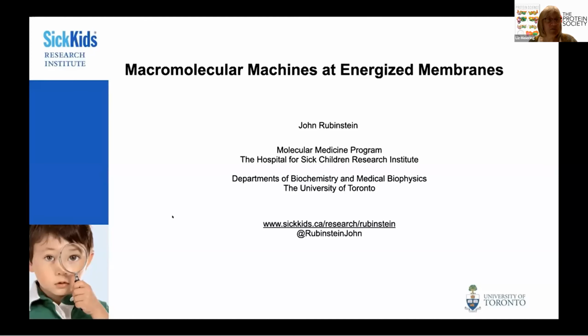So a focus of his work is macromolecular machines. We're working on molecular machines, large machines at energized membranes. So ATP synthase, and ATPase proton pumps.